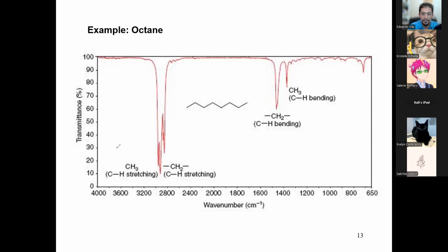So this is your sp3 CH stretching, all of these. There's probably a CH2 sp3 stretching right here. So this would be like a methylene, we call it, CH2 sp3. But which one is it? Man, I don't know. They all blend in together. We just have to be able to say, look, these are the stalactites that I know are everywhere.